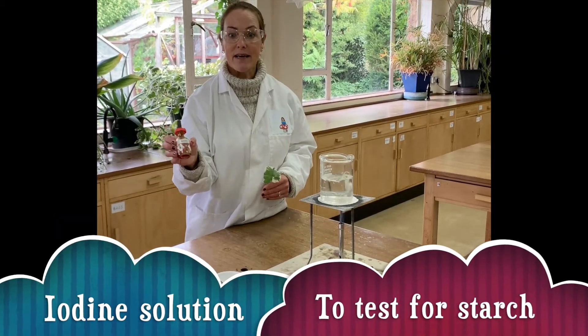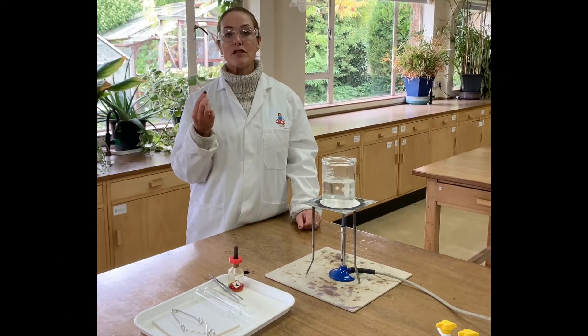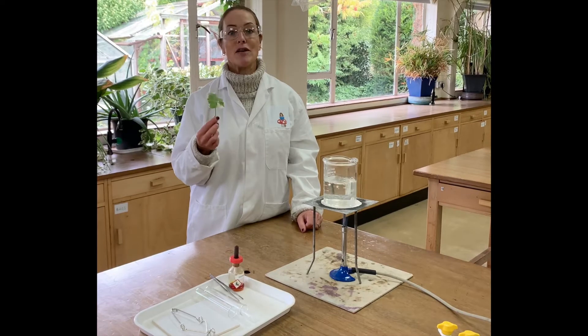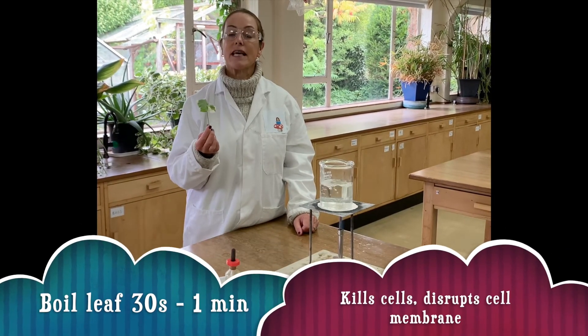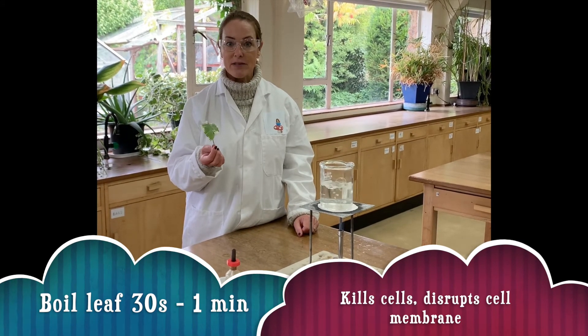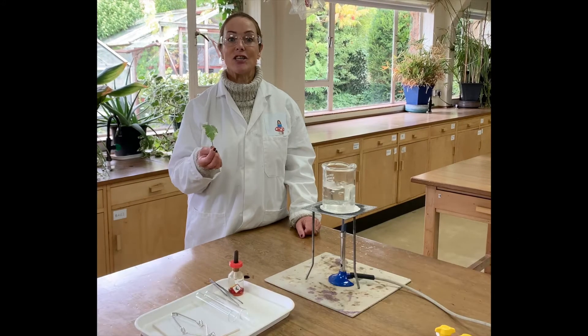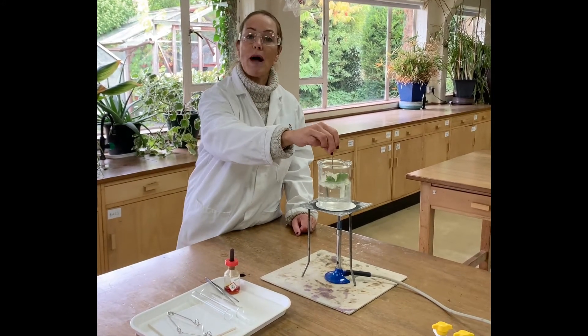I've got my iodine ready but it can't actually get into the cells of the leaf just yet. What we have to do is prepare the leaf so that iodine can enter the cells. To do this you need to boil the leaf. This kills the cells and disrupts the partially permeable membrane around the cells so that the iodine solution can get in. For the geranium leaf it only needs to be boiled for about 30 seconds.